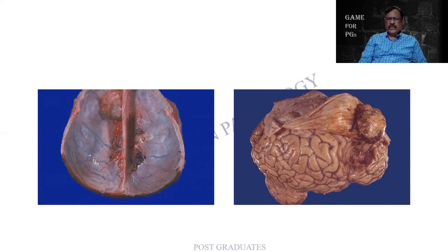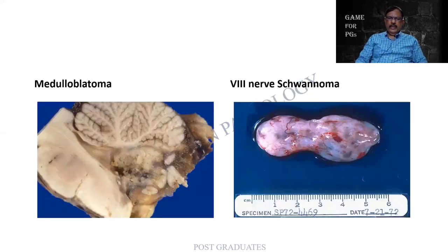So, what are all the lesions that we had seen so far? We had seen the meningitis, we had seen the areas of hemorrhages, vascular abnormalities, or areas of infarction, and then the tumor. Tumors can also be arising from the brainstem. So here there is a lot of necrosis, brain tumors or brainstem tumors in a young child.